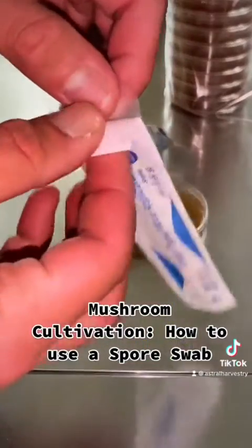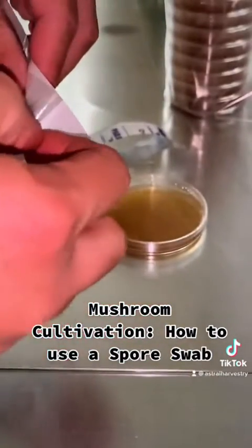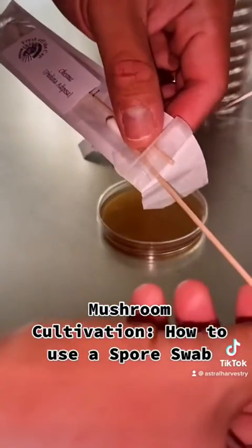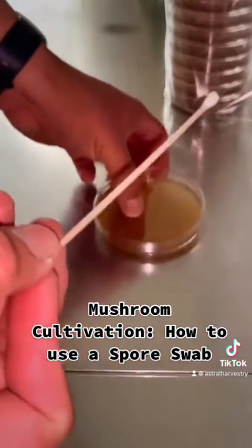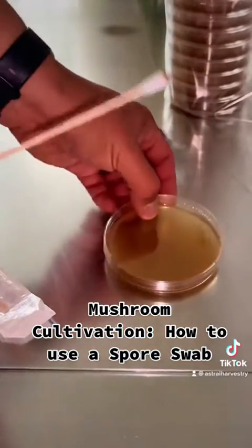Go ahead and grab your spore swabs. Keep your fingertips down by the wooden stick part — you don't want to touch anywhere near the cotton. Keep it all nice and clean, and you're going to dab it and just give it a small twist.